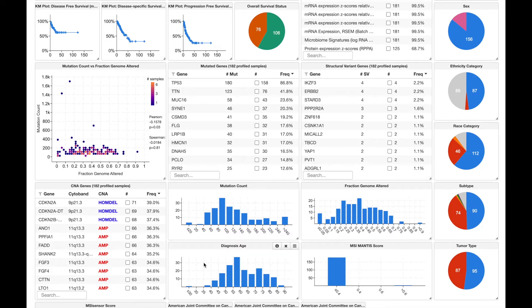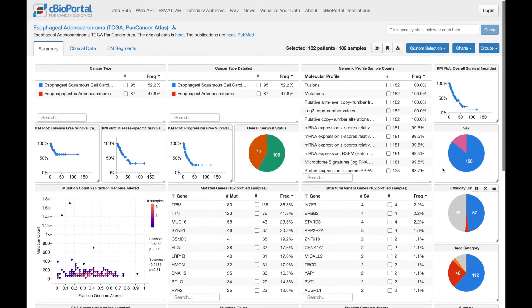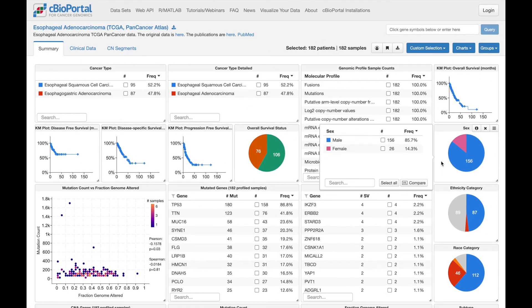We can also see data presented in histograms, like this one that shows the age at which individuals in this cohort were diagnosed with their cancer. We also see a number of pie charts, for example this one, which shows the breakdown of the cohort by sex.